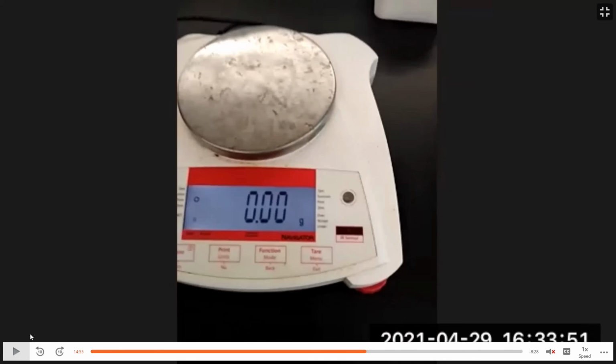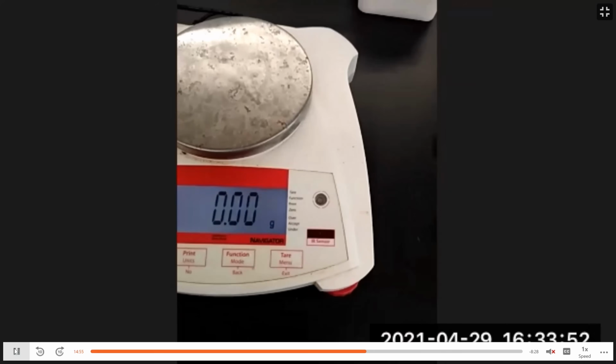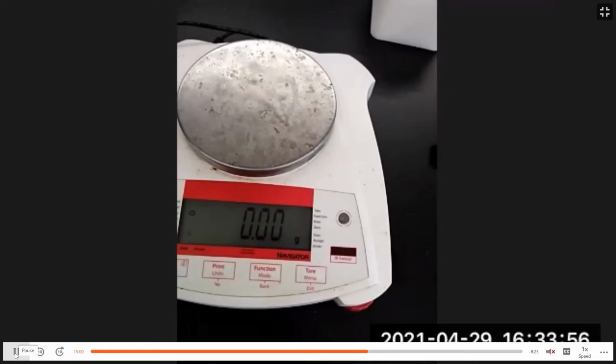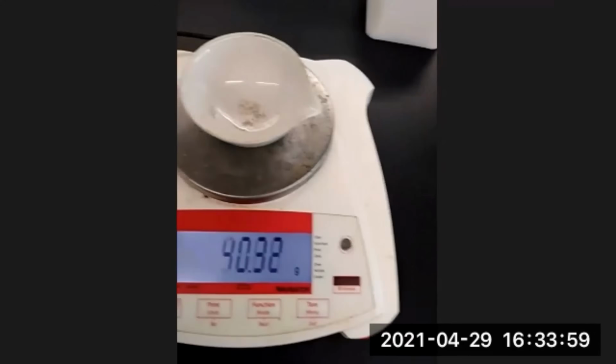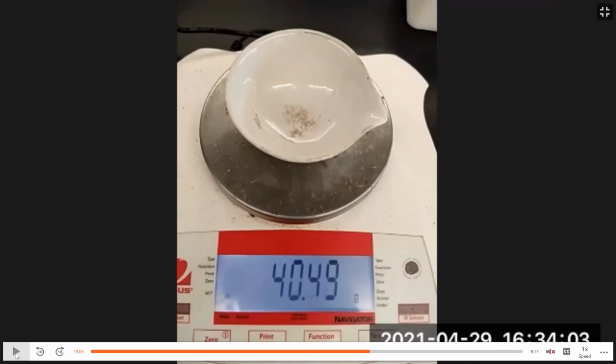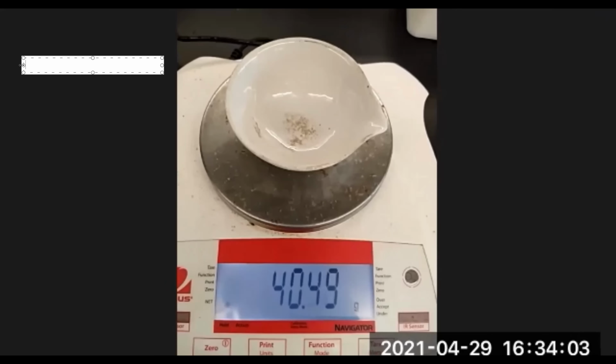So now we want to pre-weigh the evaporating dish. Let me record that mass for the evaporating dish. We're going to need it at the end to calculate the mass of product produced. So make sure you do take the mass of the evaporating dish.